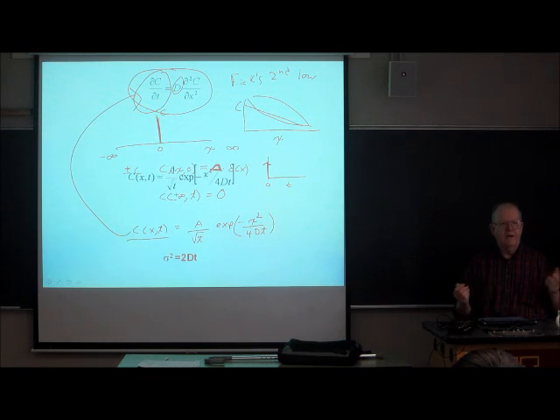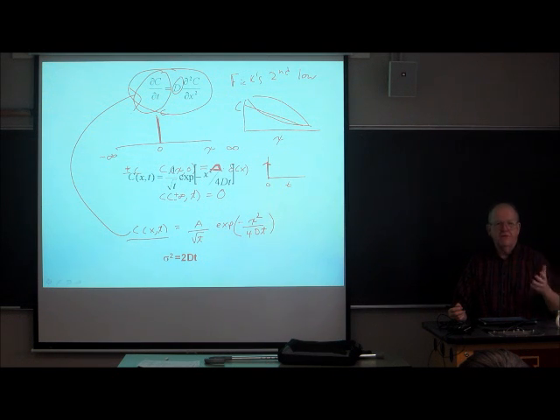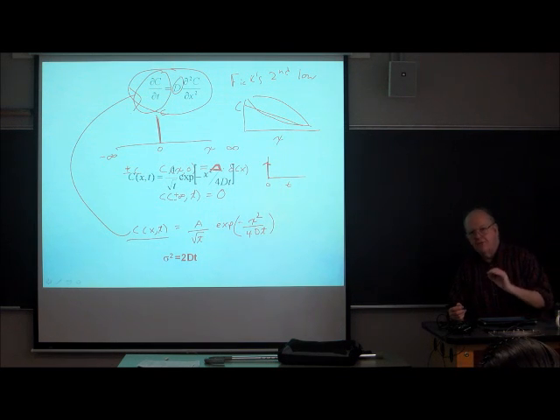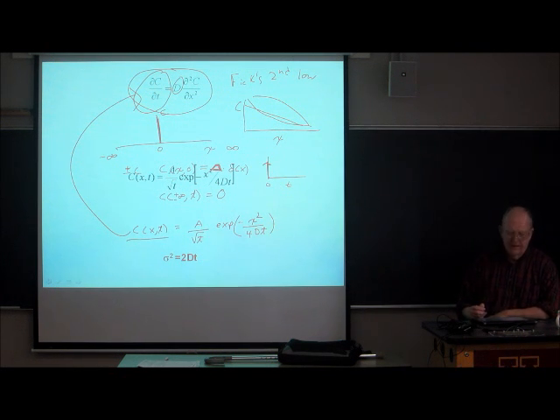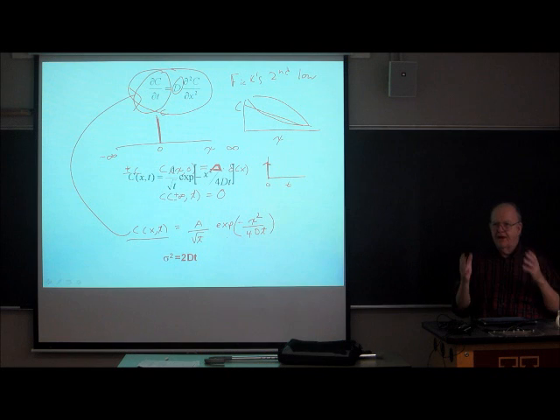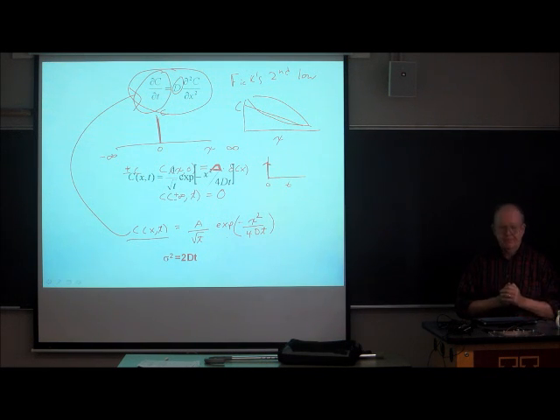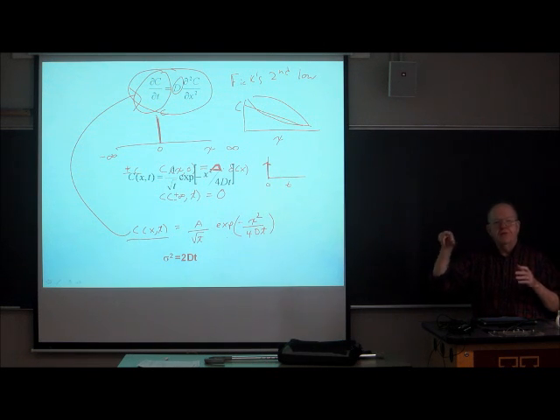And then if you ask it what's the value at infinite distances, it's going to tell you zero. And if you ask what's the value initially, it's going to tell you the initial condition. So this is the general solution of this problem with these boundary conditions. Now if you look at this equation, you can see that it's a Gaussian function of x. It's exponential minus x squared. That's the characteristic of a Gaussian function. And Gaussian functions are, you know, exponential minus x squared over 2 sigma squared. That's the way we write Gaussian equations.